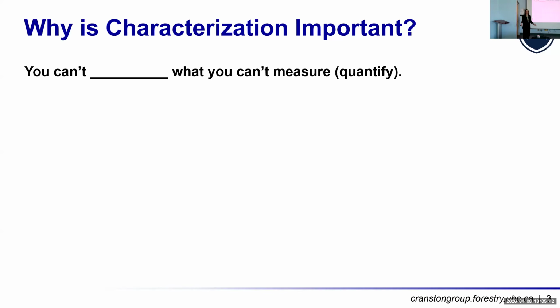We can't improve, we can't optimize. We can't say we optimized if we don't measure an output, right? Any other thoughts? Yeah. Compare. Yeah. With our last set of experiments, or maybe compare with other labs, or compare with theory, right? We don't know what we're doing. Other thoughts, maybe a little out of the academic research box. I would say that you probably can't scale, you can't manufacture, you can't sell if you can't measure, if you don't know if it meets regulations.